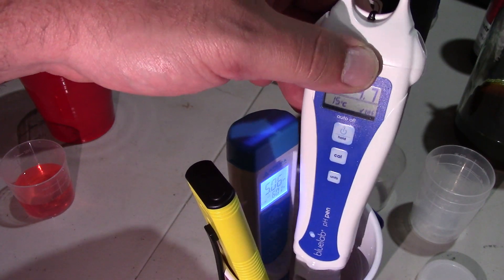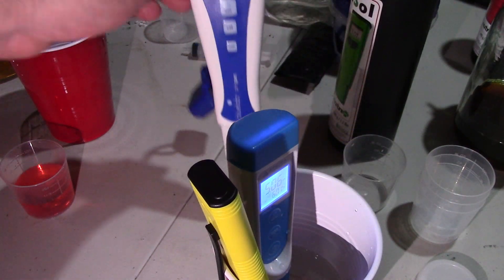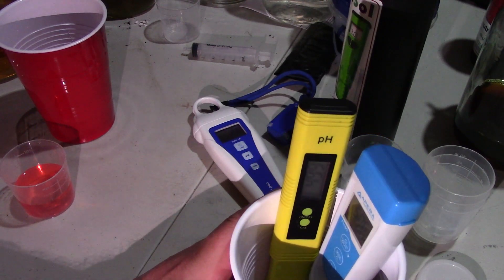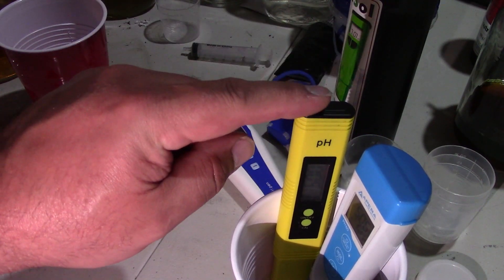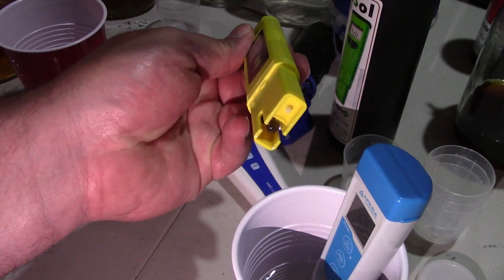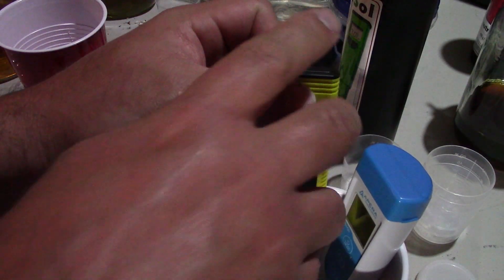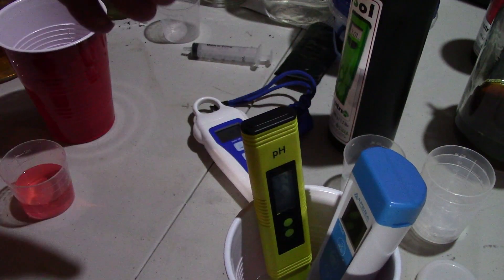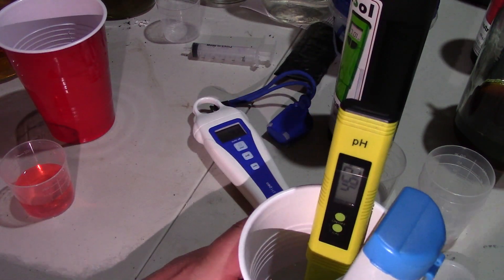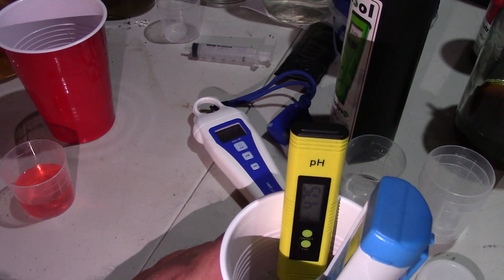I'm going to read the very limited directions that came with this to see if there's a way to get a little bit more accurate, but I don't think there is anything. Now down to these two — I haven't even calibrated this one today. I calibrated this a few days ago and it's been sitting open because it's just this cheap one and I was thinking I was getting these great pens. It's been sitting open, exposed, and you know these are not supposed to do that. So look, that's 4.6 now — I didn't even change anything. Oh, it's not all the way in, that's why. 4.75.